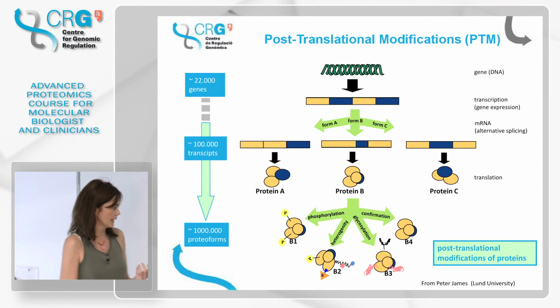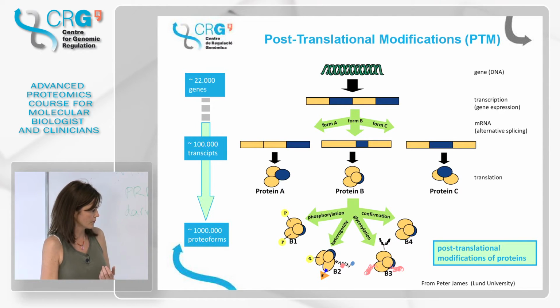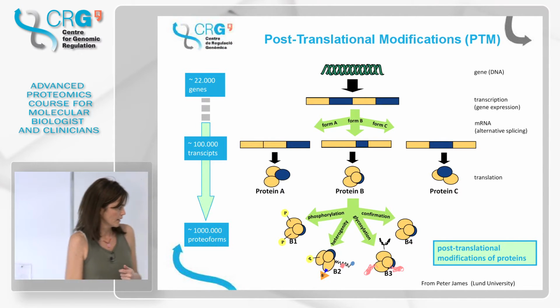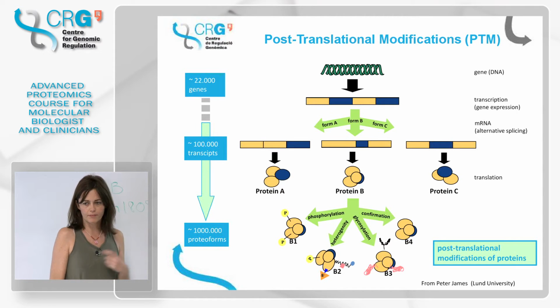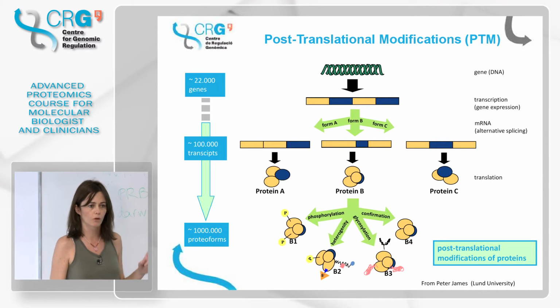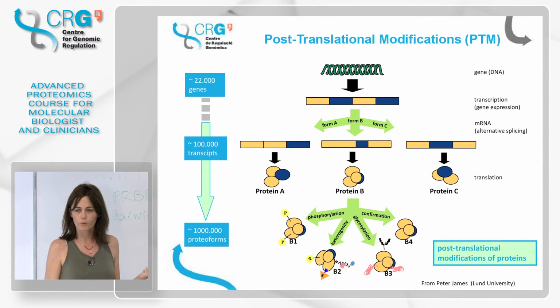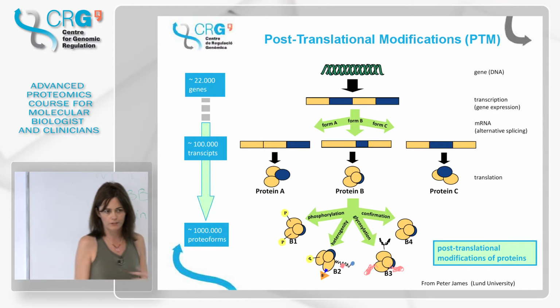And it's not only that, but each one of these modifications that are adding things to our proteins have different masses, behave differently. Usually they are in very low amount. And on top of that, we cannot just take our sample and say, okay, now I want to see all of my modifications. No, that doesn't work like that.